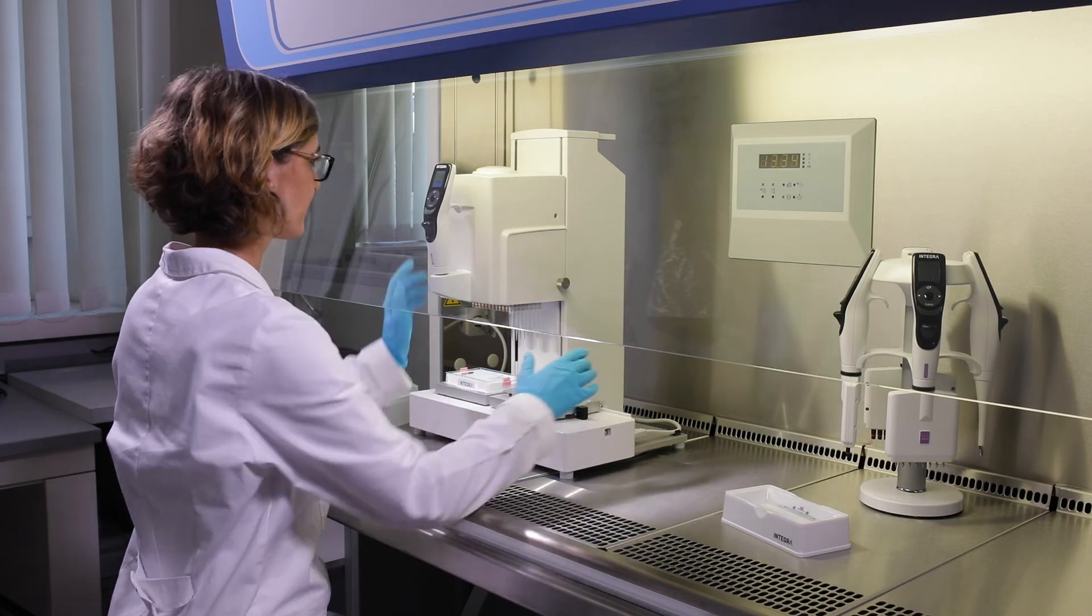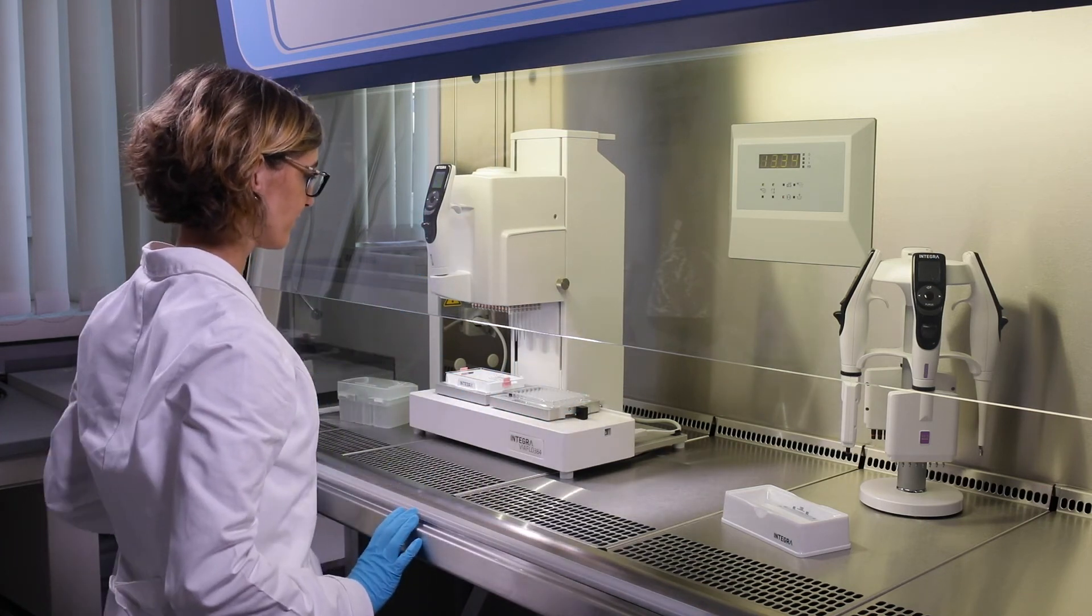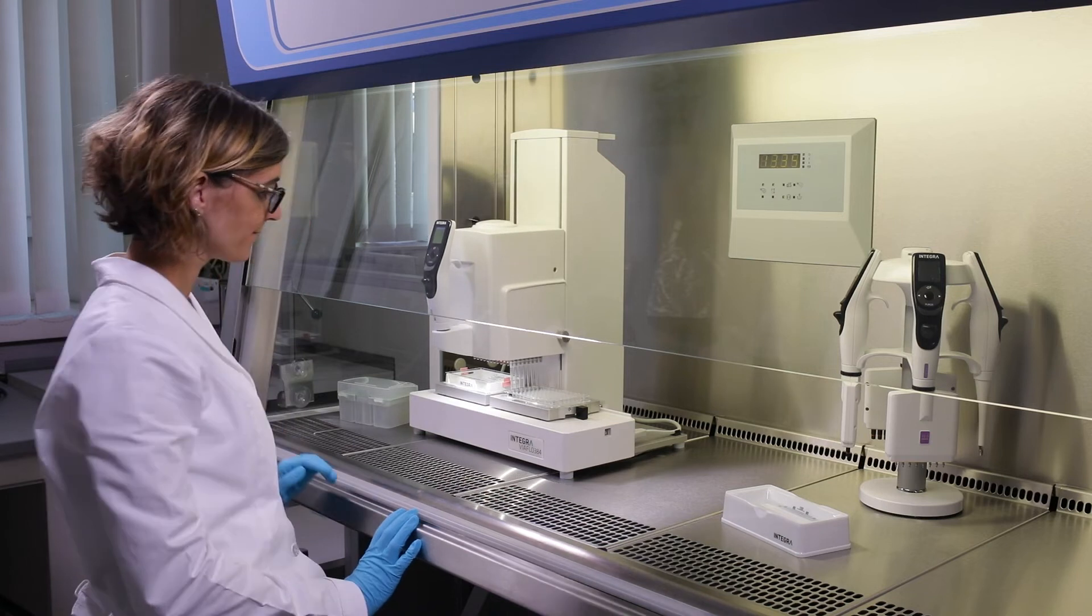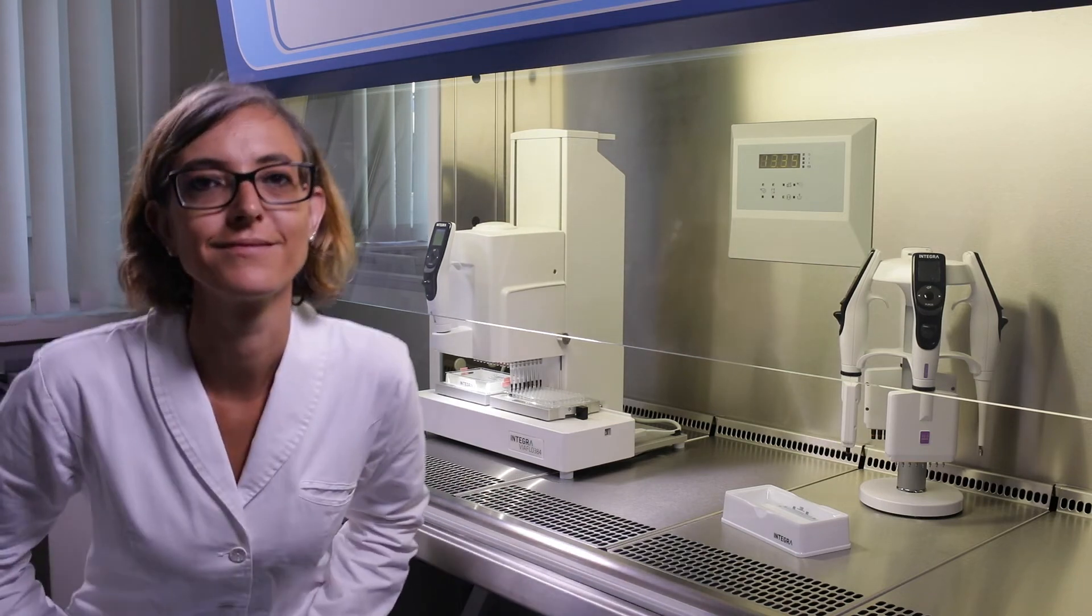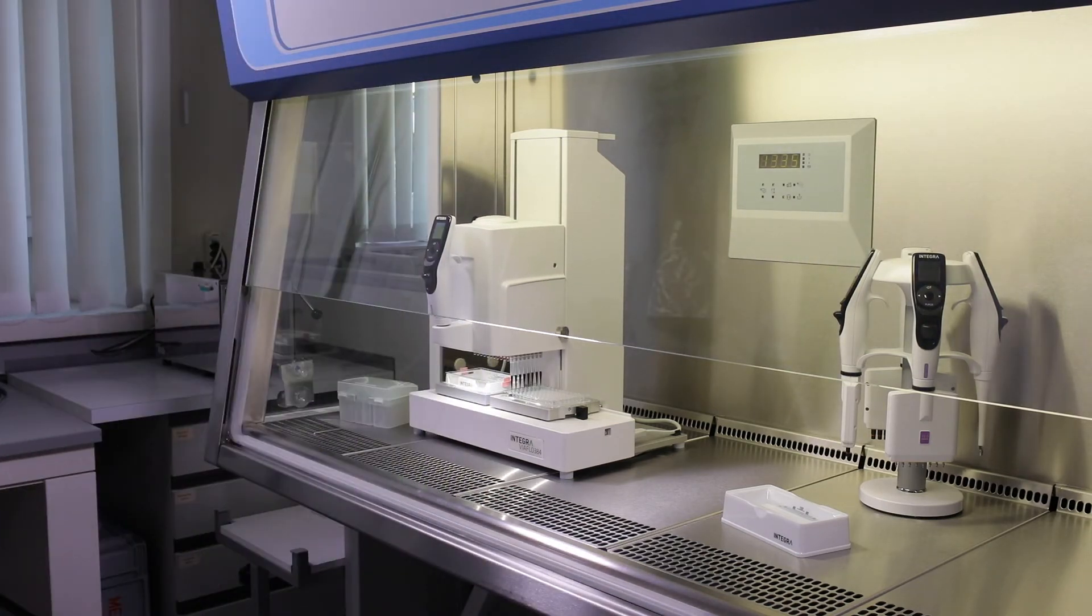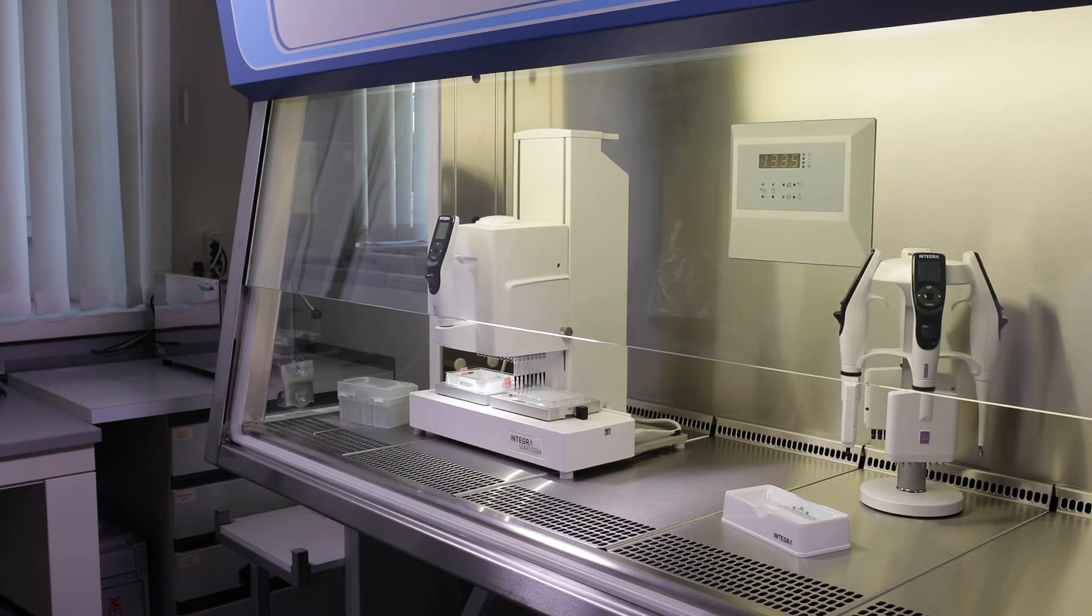In addition, you could even automate your pipetting tasks. This is especially useful in space-restricted conditions, or to ensure a process is always carried out the same way.